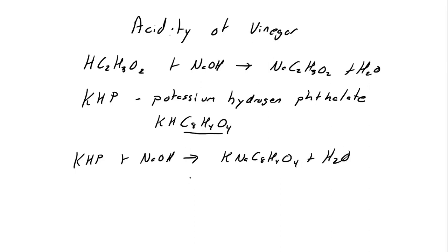Okay? And these are all balanced. What's the relationship between the acetic acid and the sodium hydroxide? What's the ratio of moles? 1 to 1. And the KHP to sodium hydroxide is also 1 to 1. Okay? So again, 1 through 4 can be answered from the first page of this. Okay? So I'm going to start with number 5.